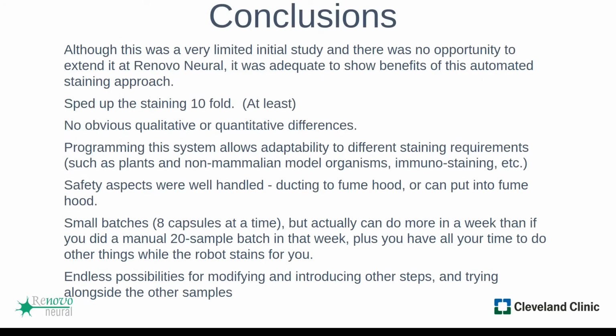So as a conclusion, multiple conclusions. This was a very limited initial study, and there was no opportunity to extend it at Renovo Neural. But with what we worked on, it was adequate to show the benefits of this automated staining approach and that it could be used without affecting earlier projects or causing major problems within a lab's workflow.